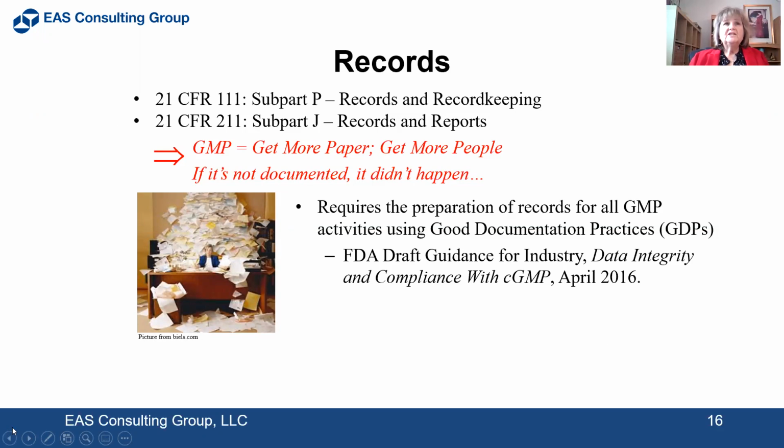A lot of people will say GMP stands for get more paper, get more people. I've heard of giant mountains of paper. The one phrase to keep in mind: if it's not documented, it did not happen. That is the way the FDA looks at it. So you have to keep records on everything.